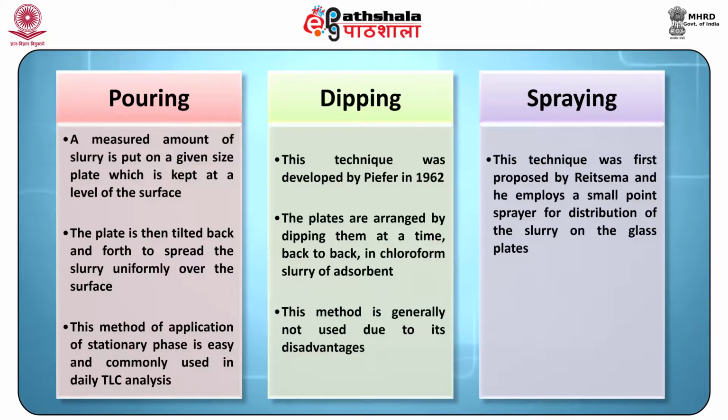This method of application of the stationary phase is easy and commonly used in the daily TLC analysis. Dipping. This technique was developed by Pfeffer in 1962. The plates are arranged by dipping them two at a time back to back in chloroform slurry of the adsorbent. This method is generally not used due to its disadvantages.